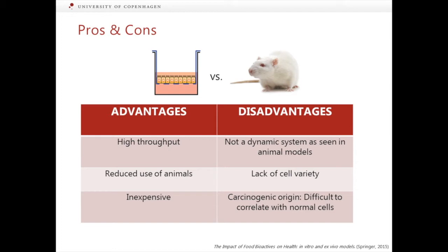Even though these in vitro transport studies can give a good indication of whether in vivo absorption is likely to occur or not, there are both pros and cons regarding their use. The advantages and disadvantages are both linked to the fact that in vitro transport studies are extremely simplified versions of the physiological conditions. This allows for a high throughput and relatively low expense compared to using animals. On the other hand, there is not always a strong correlation between the results obtained from cell monolayers and animal studies. It is therefore important to remember that these studies cannot stand alone, but are a useful tool in predicting and ranking different compounds based on their permeability.